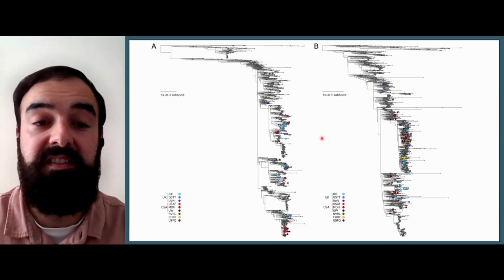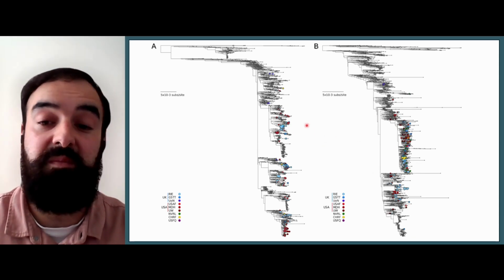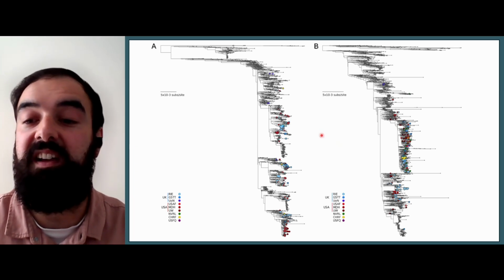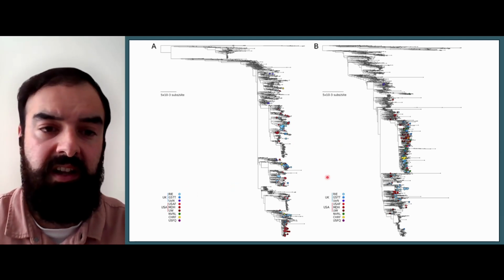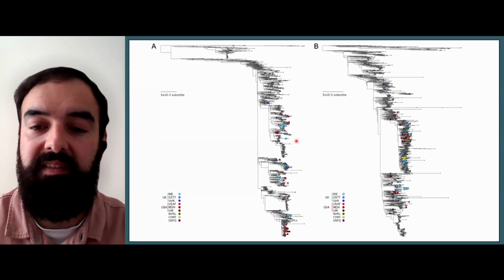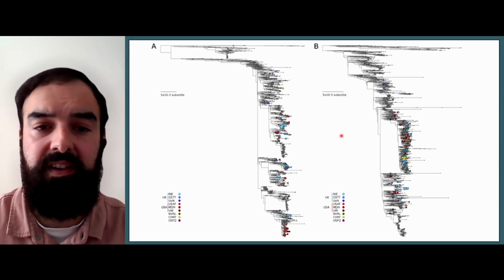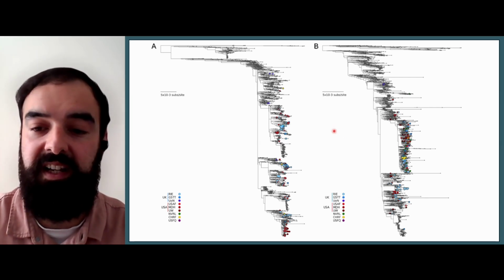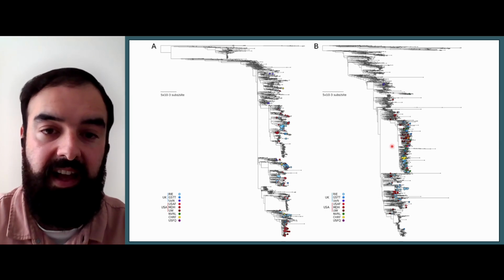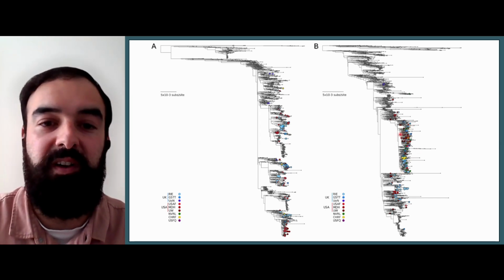As you can see, the sequences in the study land all over the tree, and they suggest that our primer schemes are able to capture a wide range of the currently circulating diversity in both RSV-A and B at the moment. If you have a look at the legend, you'll see the colors assigned to each country, with blues being labs in the UK and reds representing labs in the USA. And it appears that there is quite a lot of geographical mixing of RSV genotypes, with sequences from each geographical area not really clustering particularly tightly with other sequences generated in that area. You can see here that in the RSV-B tree, for example.